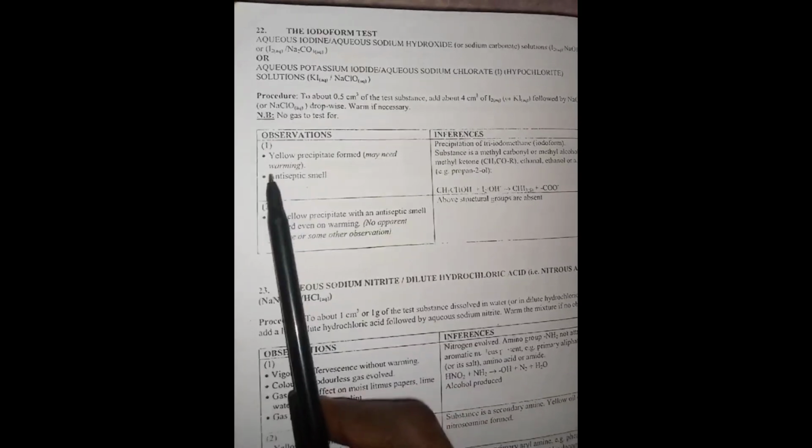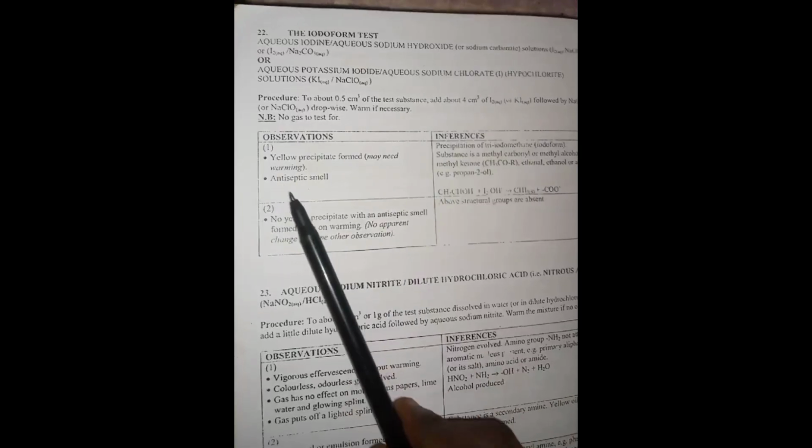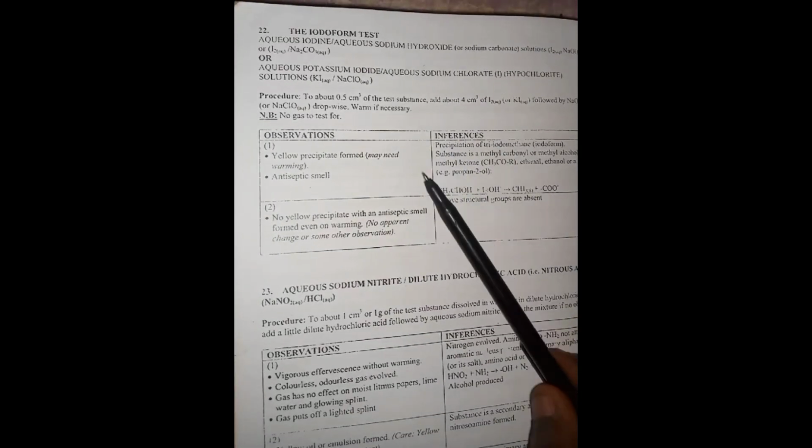Now, with iodoform, guys, I expect to see a yellow precipitate if any of the compounds I listed, namely ethanol, methyl ketones, secondary alcohols, are present. I expect to see a yellow precipitate formed. So this is it. I have yellow precipitate formed, may need warming, and antiseptic smell. Good. These are the observations. You write it under observations. Then inference, you do the same. You copy everything, the equation.